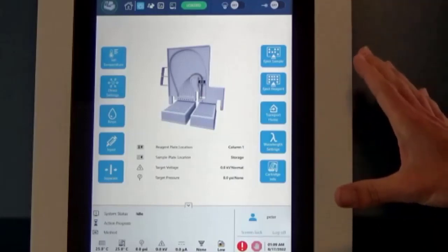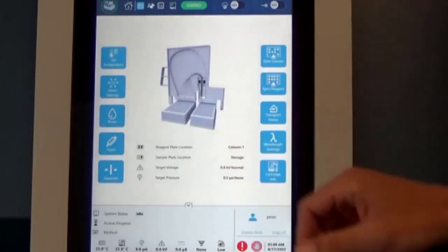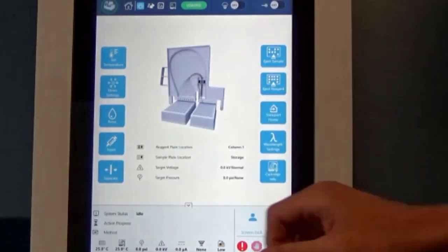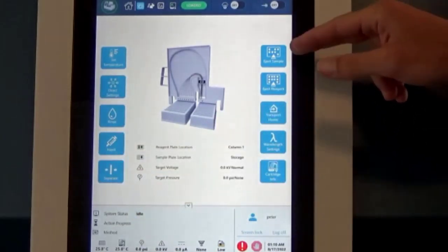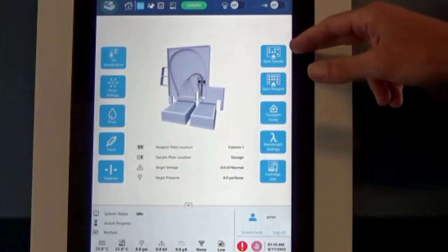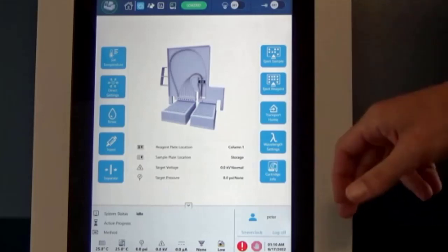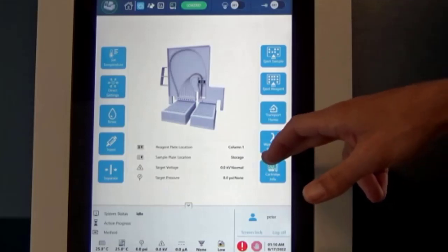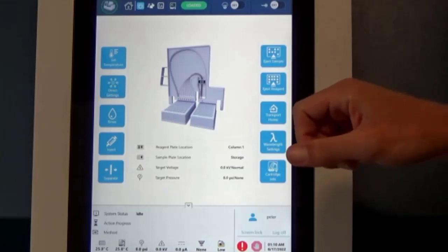So we can still do all the same manual things that we're used to being able to do: manually setting our capillary or sample garage temperature, doing manual rinses, manual injections, manual separations. This is also where we can manually eject our sample trays, eject our reagent trays to load those in. We can look at cartridge info, which is something that's new, and we'll also be able to load and eject our capillary cartridge.